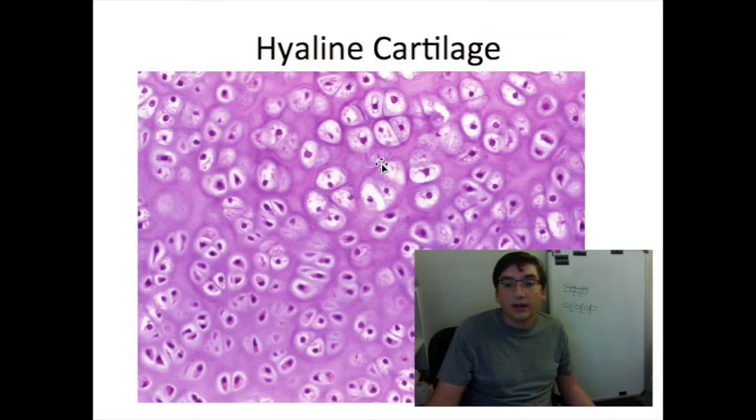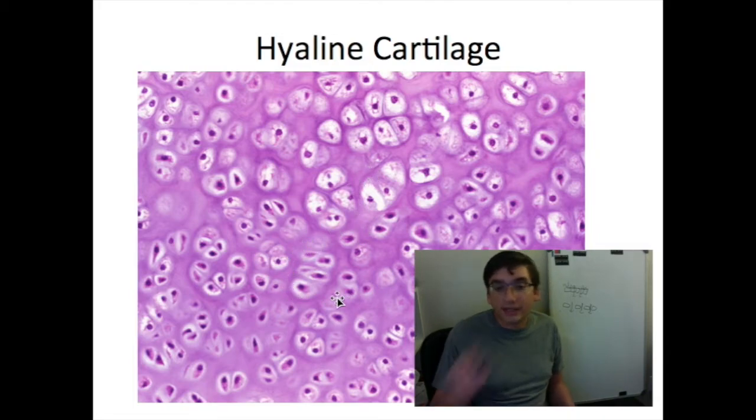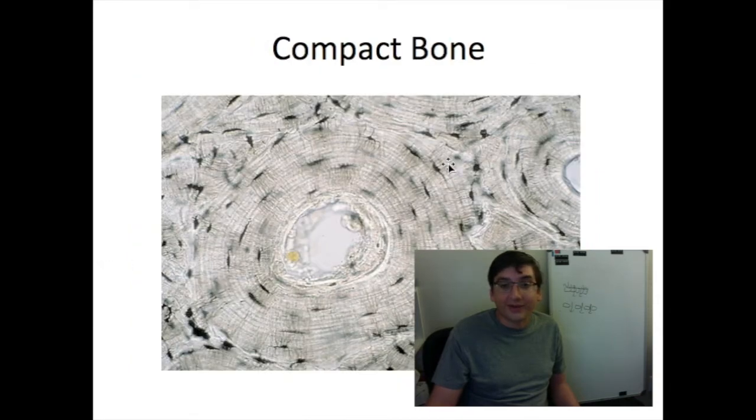this class are, this is hyaline cartilage. This is a chondrocyte, and the chondrocytes are surrounded by this purple kind of gelatinous extracellular matrix, which is a lot of protein and a lot of carbohydrate to help provide a glue, a ground substance. So the cartilage in your nose and on the ends of your joints provides a kind of sturdy toughness. But there's no blood vessels, so it heals very slowly. If you've ever broken your nose, you would know what I'm referring to. It doesn't go back very well.